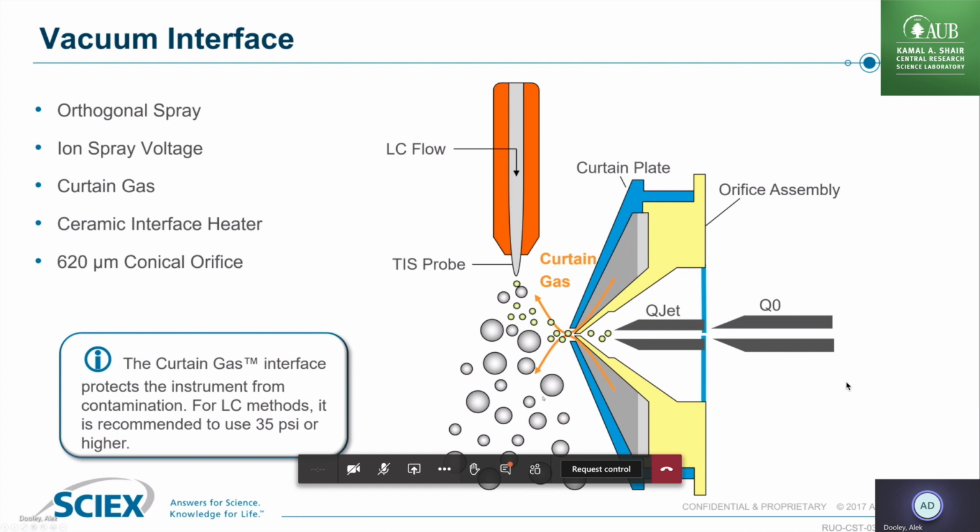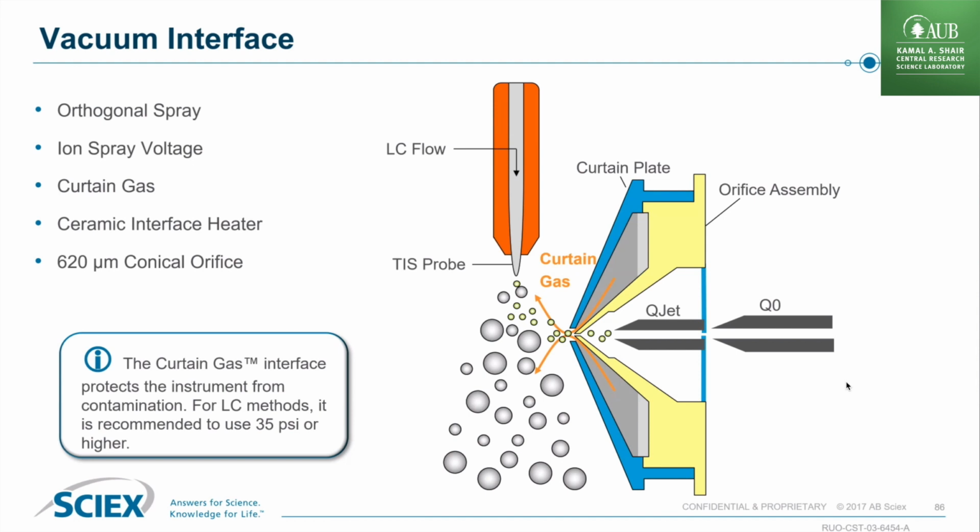All right, so you may think, okay, how are the ions getting into the instrument, because it's a vacuum, right? Like your vacuum cleaner in your house, when you go around with the vacuum cleaner, it sucks everything inside. Isn't the instrument sucking everything into it with the vacuum? Well, think about that for a second. If we did that, we would basically end up sucking the whole contents of the lab into the instrument, all the atmosphere in the room and everything, all small hairs and dust. I mean, that would be a huge mess. The instrument would get dirty very quickly.